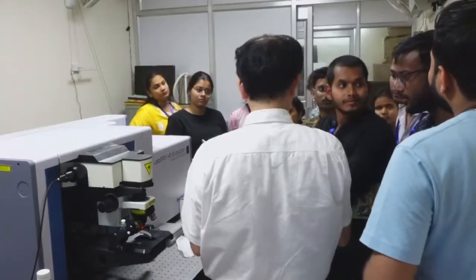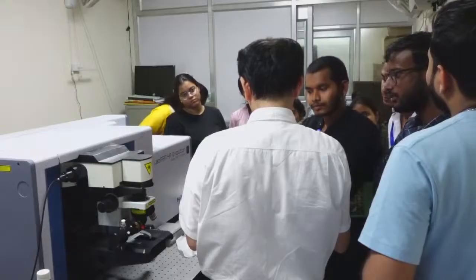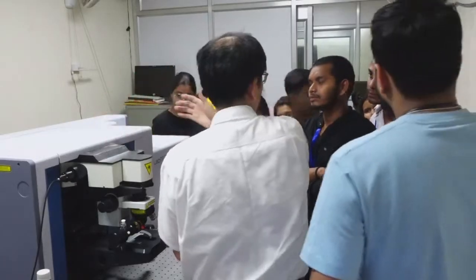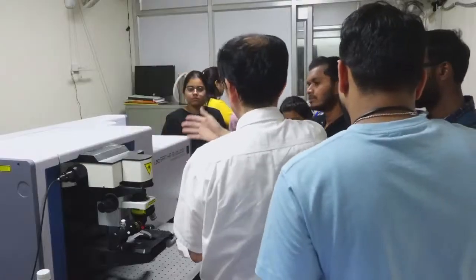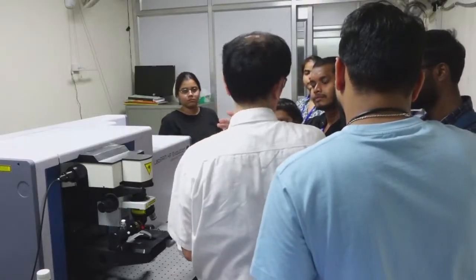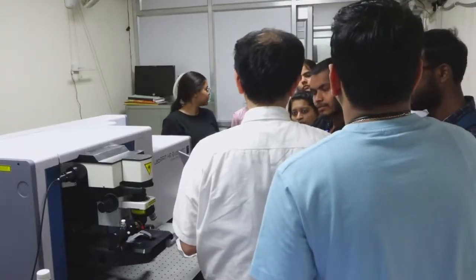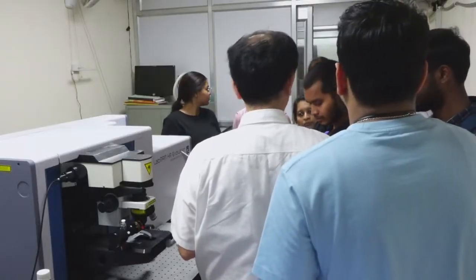Sir, how are you separating the Rayleigh scattering? By putting a dichroic mirror and filter, and it shuts out the Rayleigh line. It makes the measurement very difficult, so we remove it.